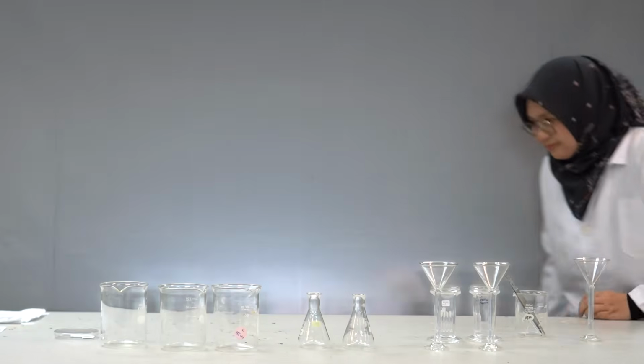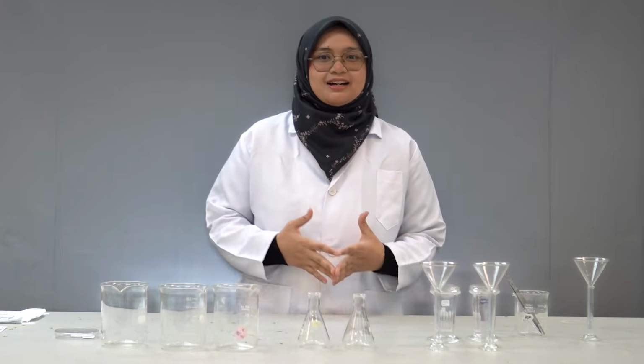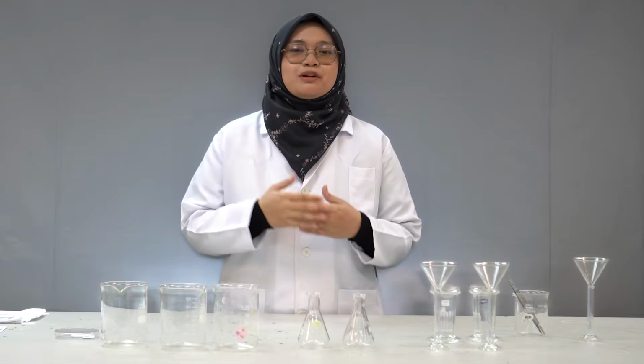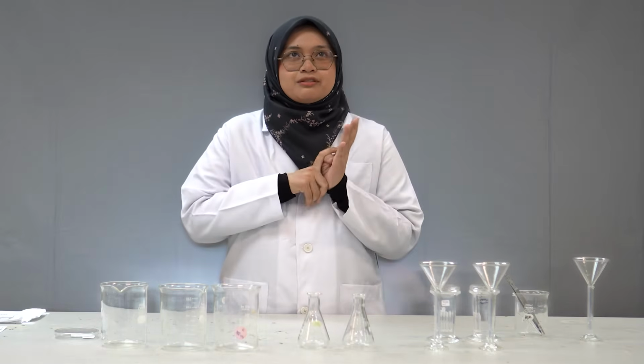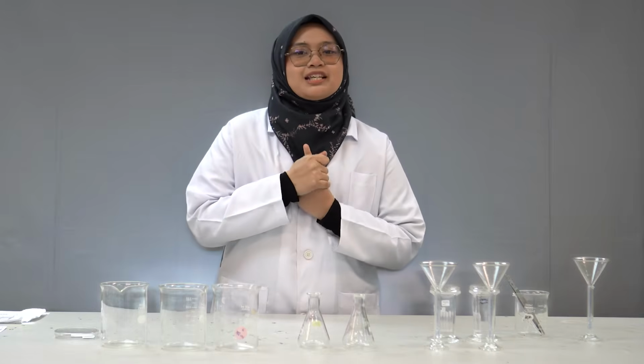Okay, thank you to Sister Nabila. Today I will explain the safety and precautions of the TLC experiment. I will explain this in three parts: before the experiment, during the experiment, and after the experiment.